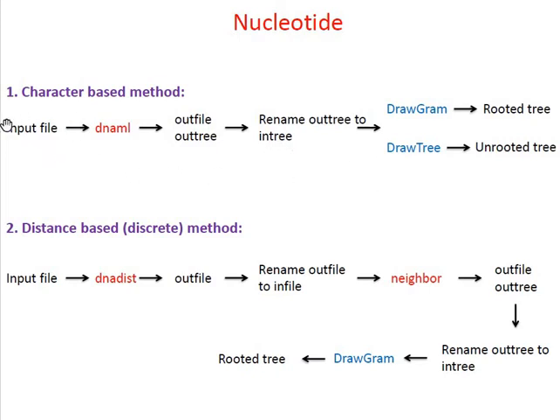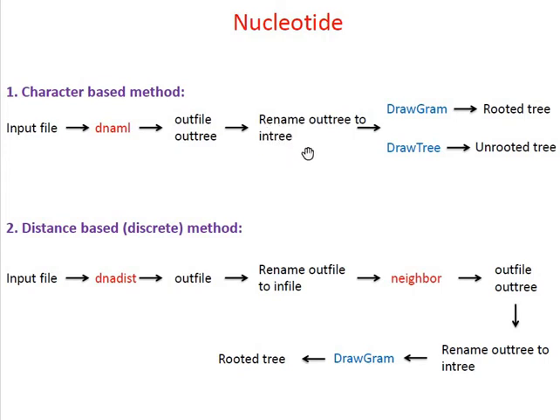First you will need an input file, which can be in the form of a text document or in PHYLIP input file format. This input file is taken by the DNA ML program, and after processing it will give you two files: an outfile and an outtree file. The next step is to rename this outtree file as 'intree,' so that the outtree becomes an input file for the next step — using DrawGram or DrawTree for obtaining different types of phylogenetic trees. DrawGram is used for rooted trees and DrawTree for unrooted trees.